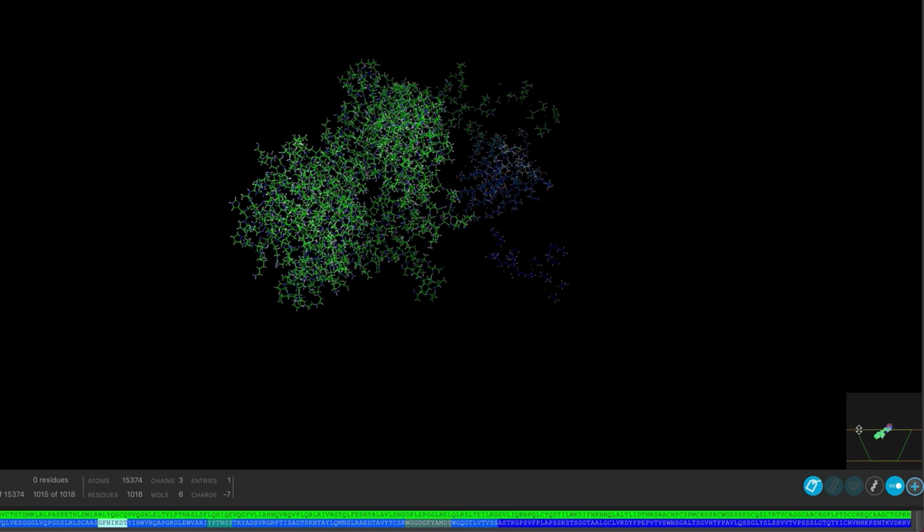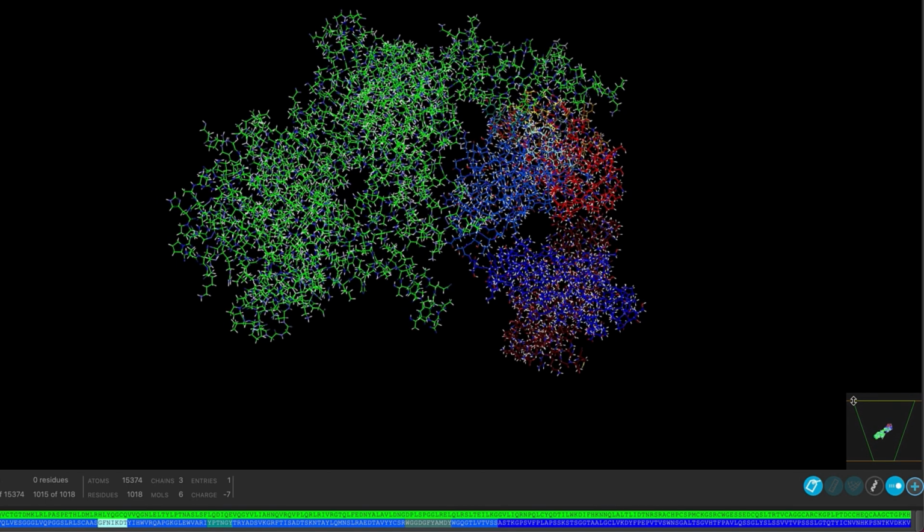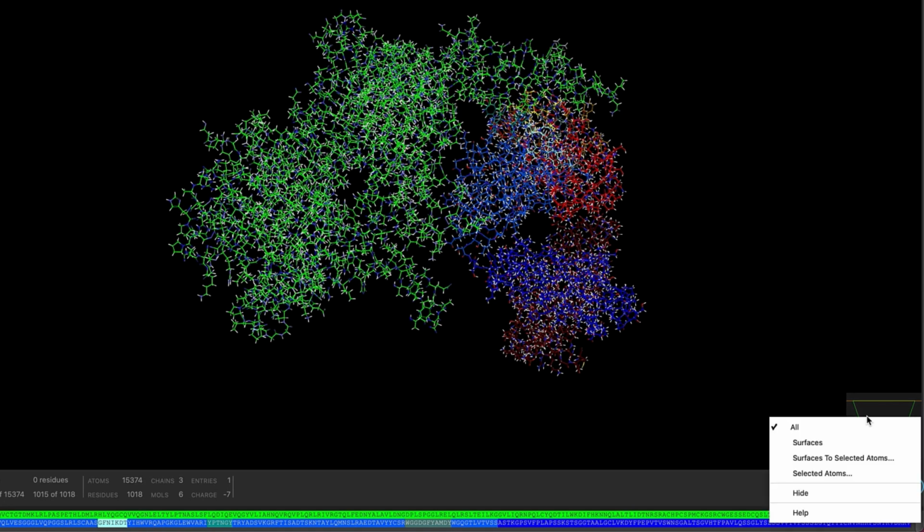If you wanted to adjust one part of the workspace structure you clipped through, how do you think you could change your clipping planes? That's right, even clipping planes are right-clickable. For now, let's keep them set to all.